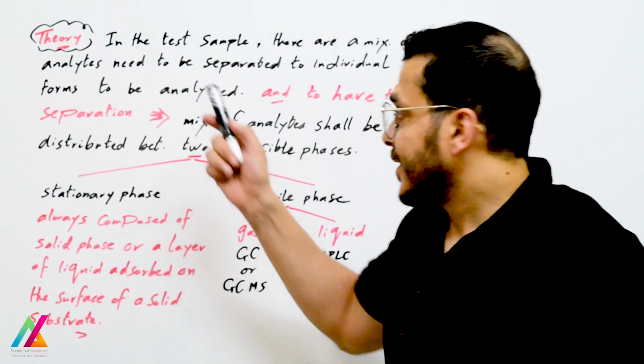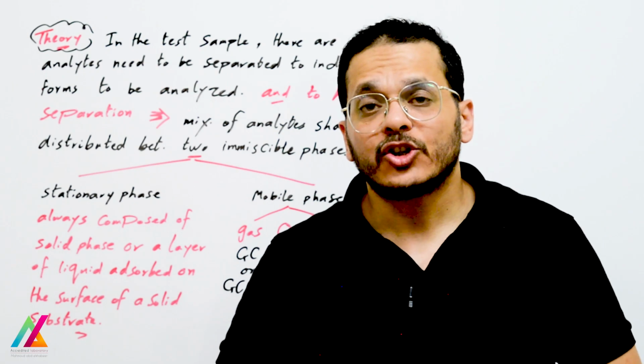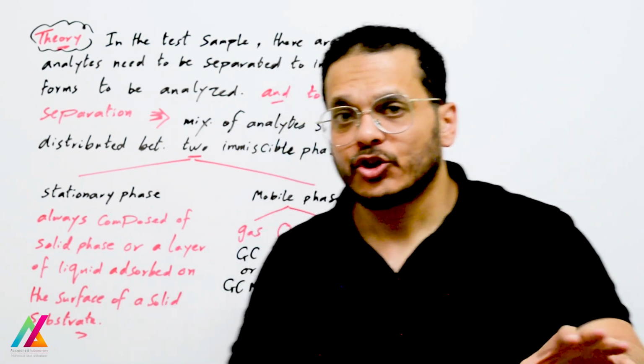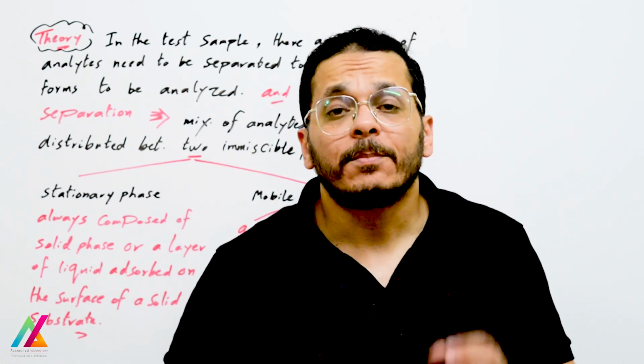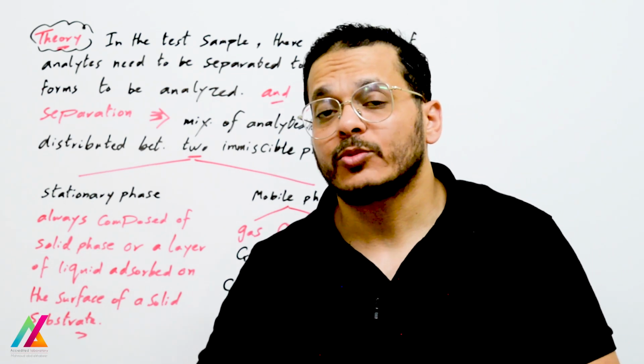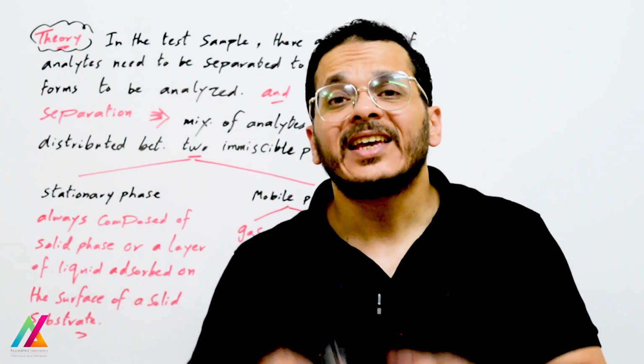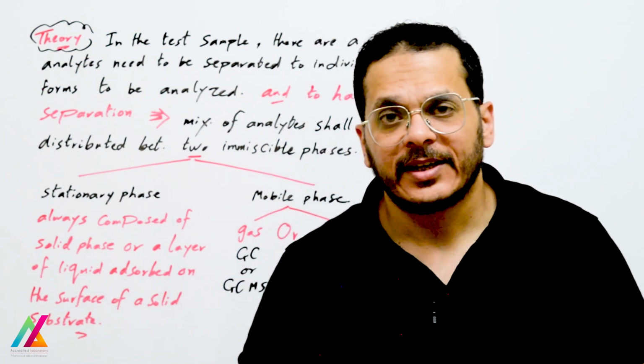So the test sample is the sample to be tested on the instrument after extraction. In the test sample there is a mixture of analytes that need to be separated into individual forms or components to be able to identify and quantify the target analytes in this matrix.